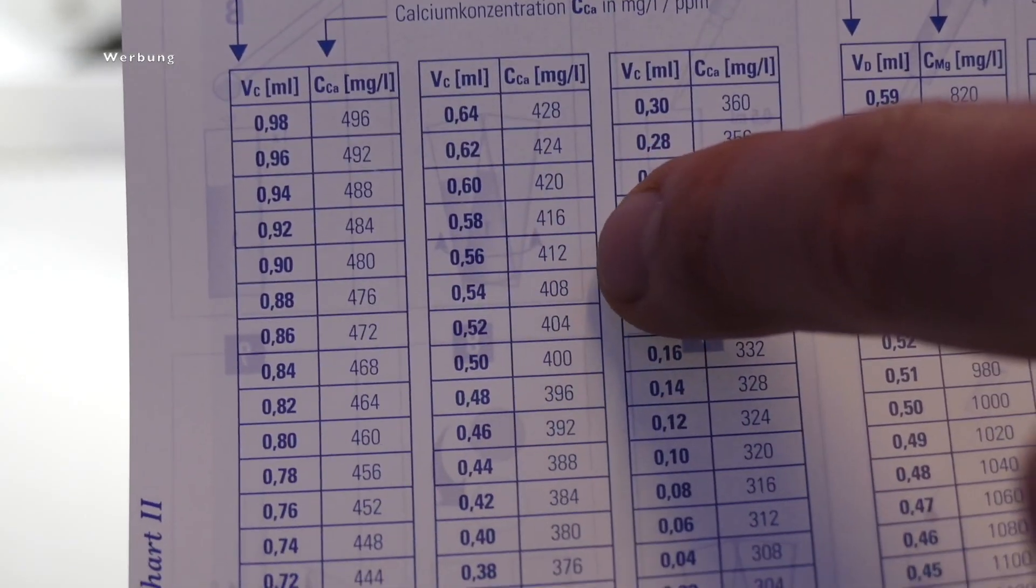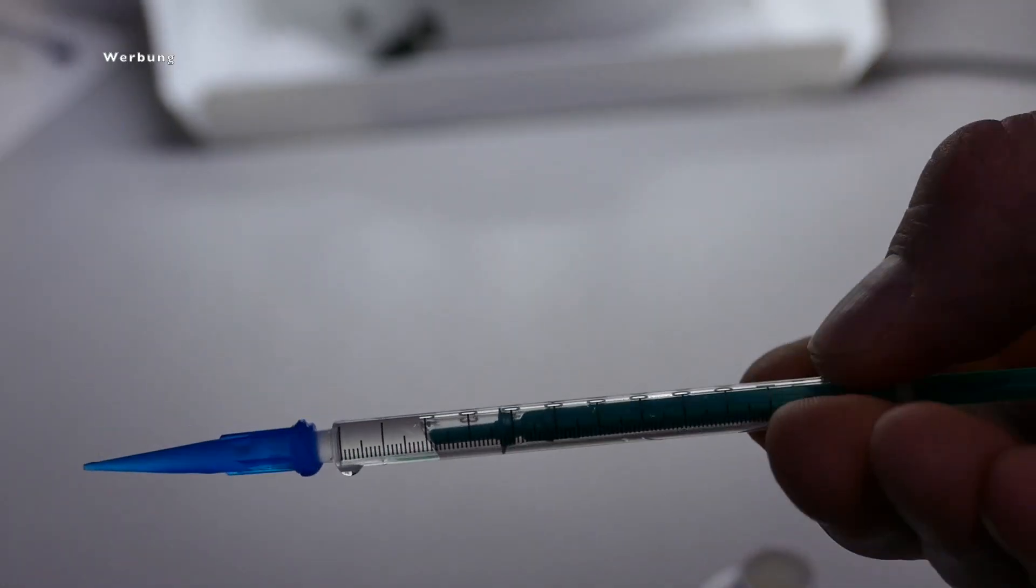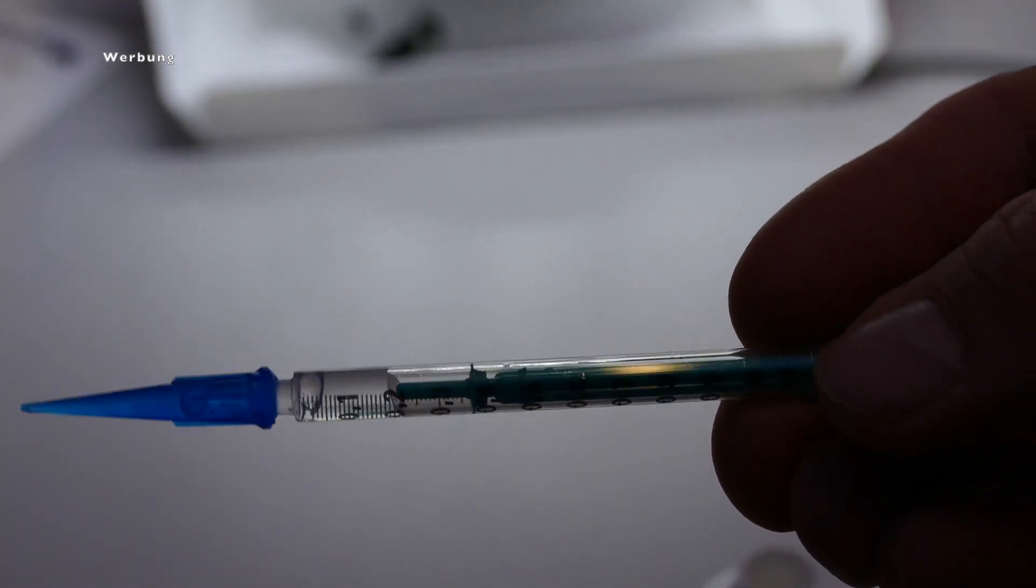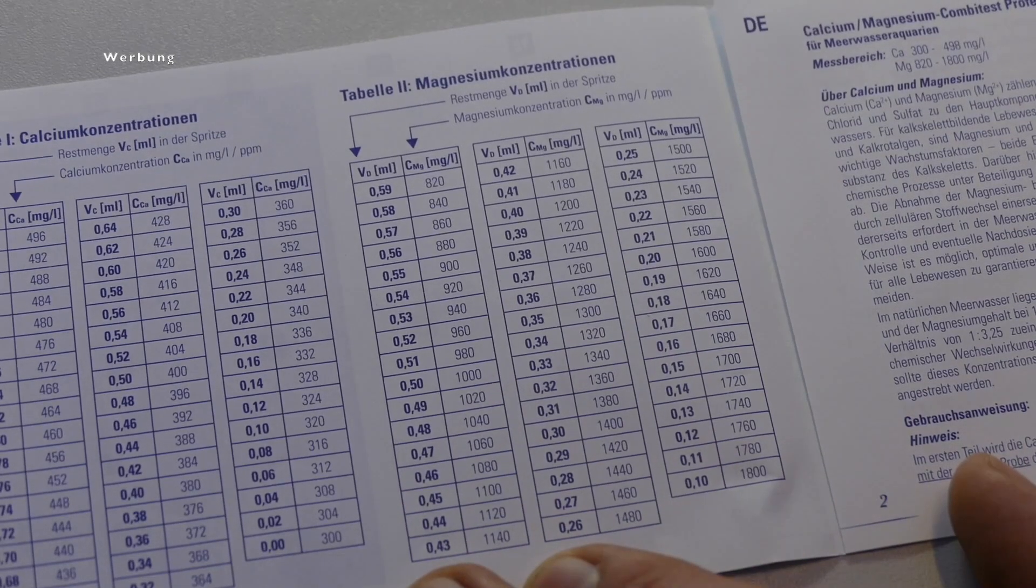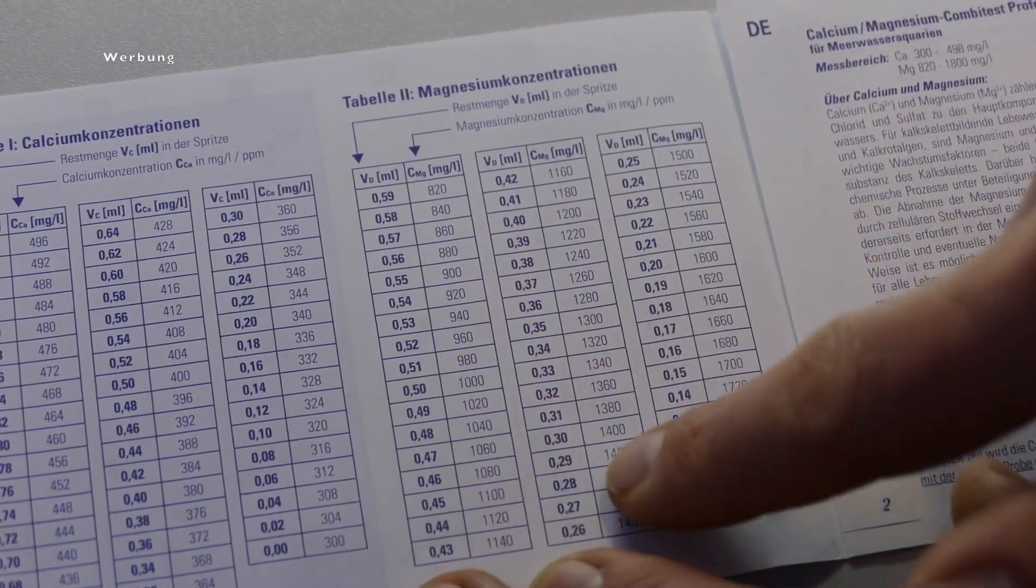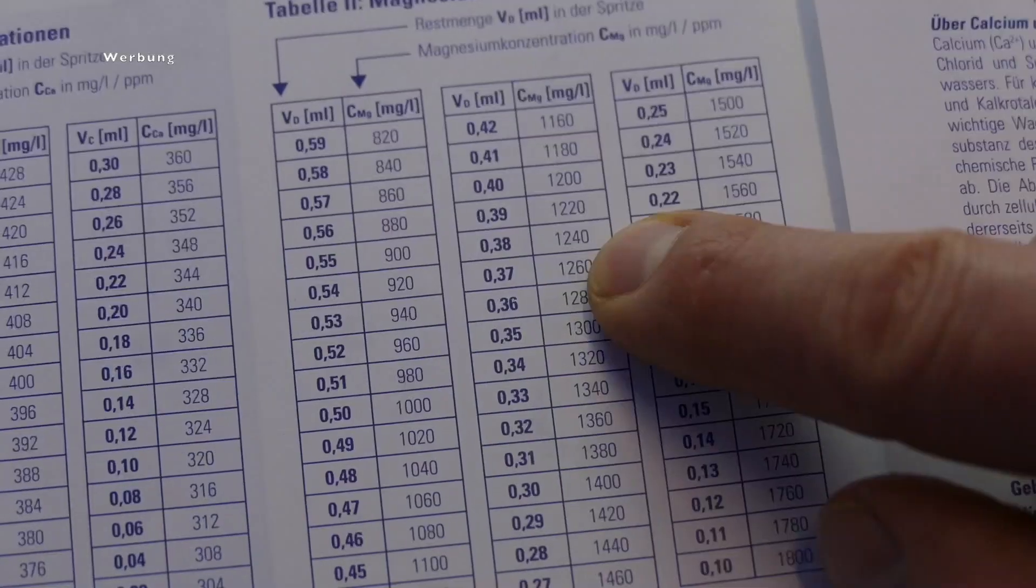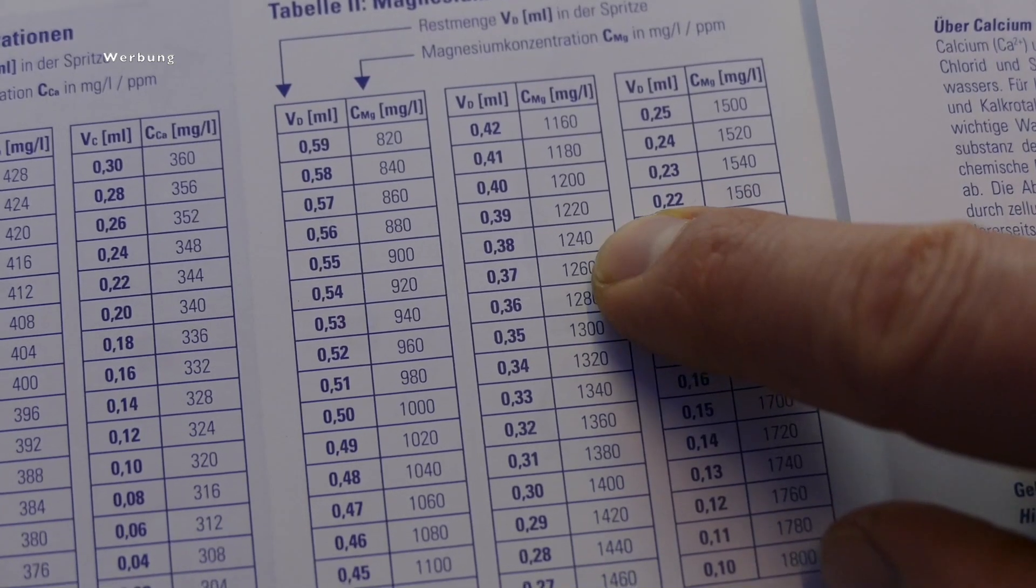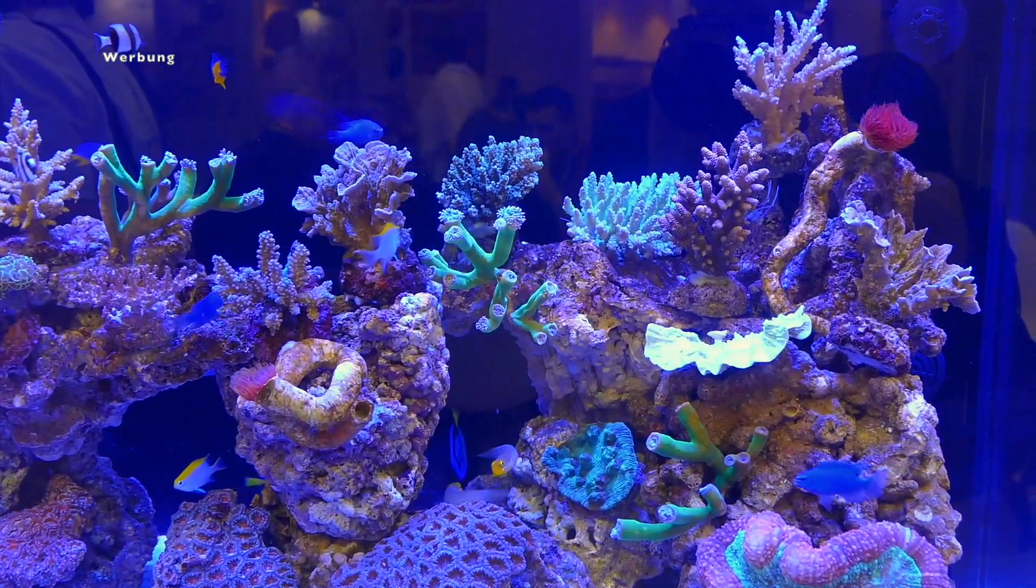Of course, we do the same thing when we determine the magnesium level. So when we have the color change from the light blue to colorless, we read off the syringe, the broad green markings, and with this amount we can then look up in the table what magnesium level we have. In this case, I now have a value of 1240. So I could use an increase a little bit.